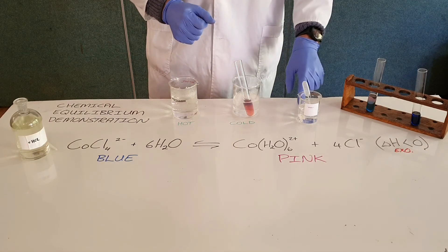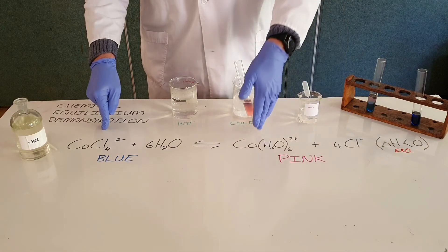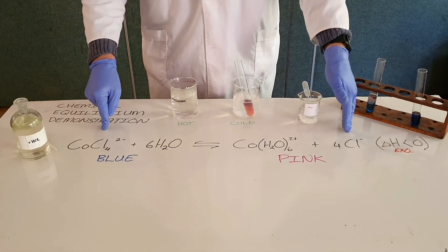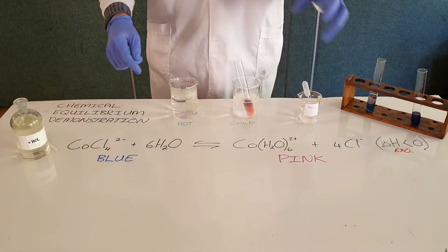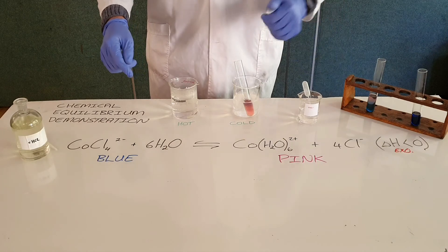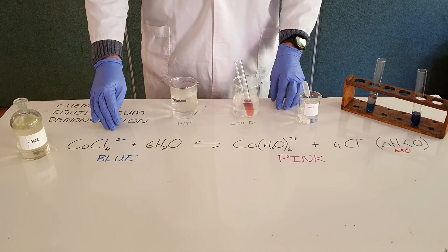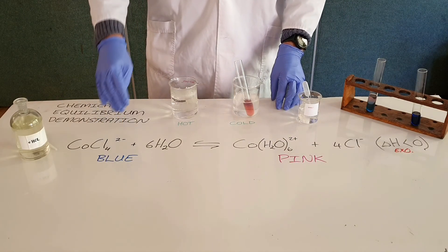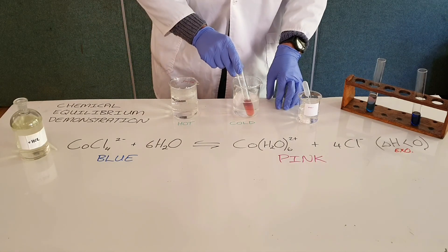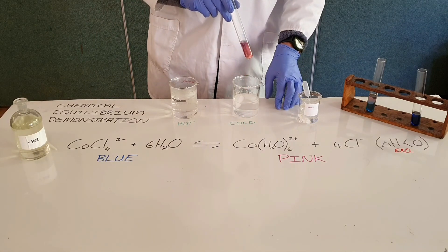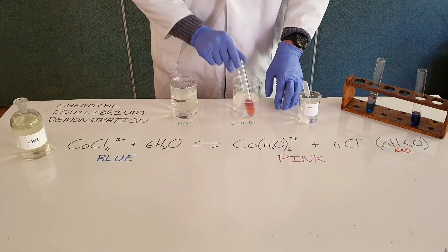Finally, the common ion effect has shown us that by increasing the concentration of one of our products, we favored the reverse reaction to try to decrease that concentration — again demonstrating Le Chatelier's principle, which always tries to counter the change that has been made. And here we can see we have gone back to a pink solution in the cold water bath.